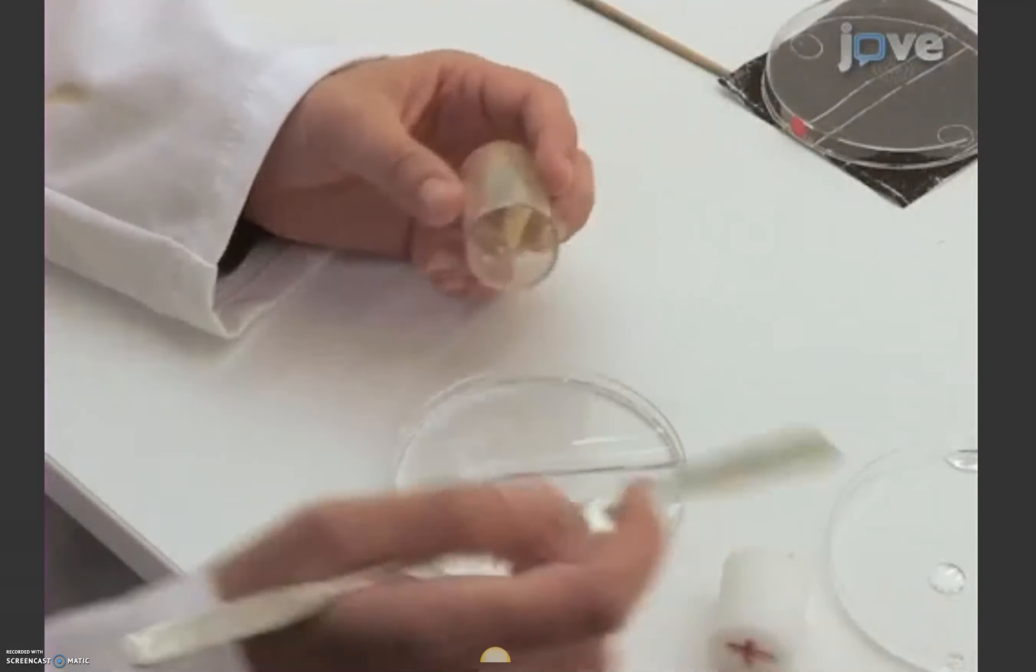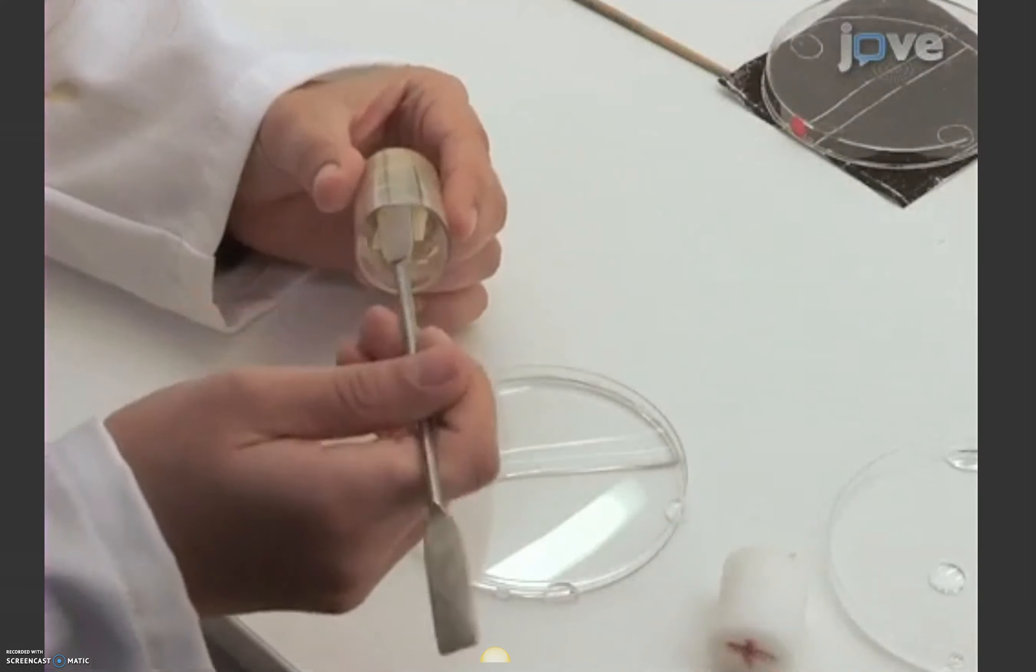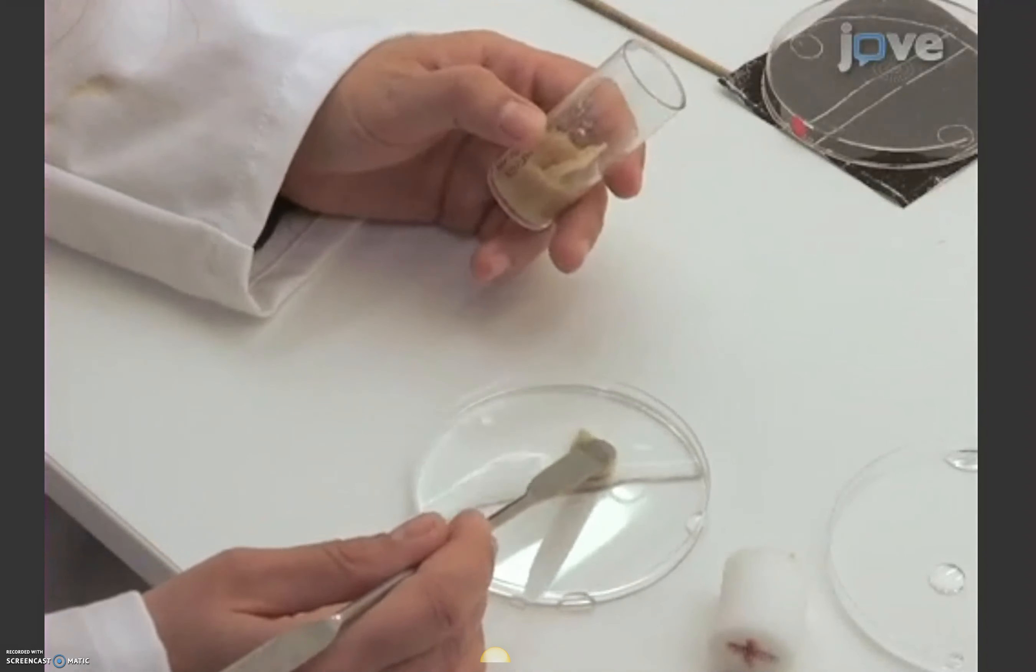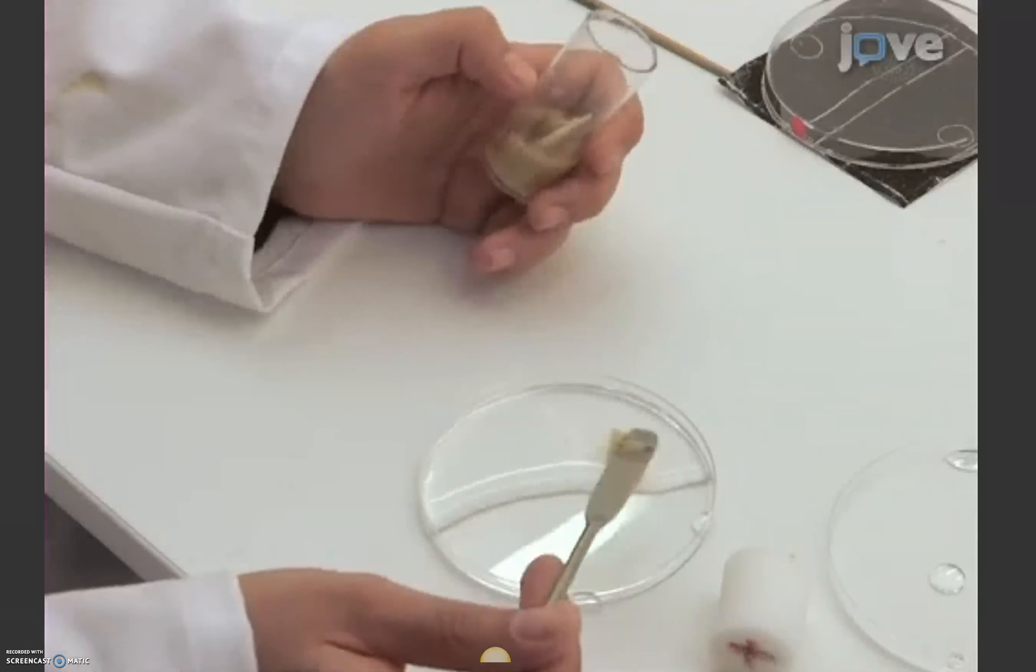Begin by collecting 30 feeding, not wandering, third instar larvae from a food vial. This protocol can be run at any time of day. It is independent of circadian rhythms.